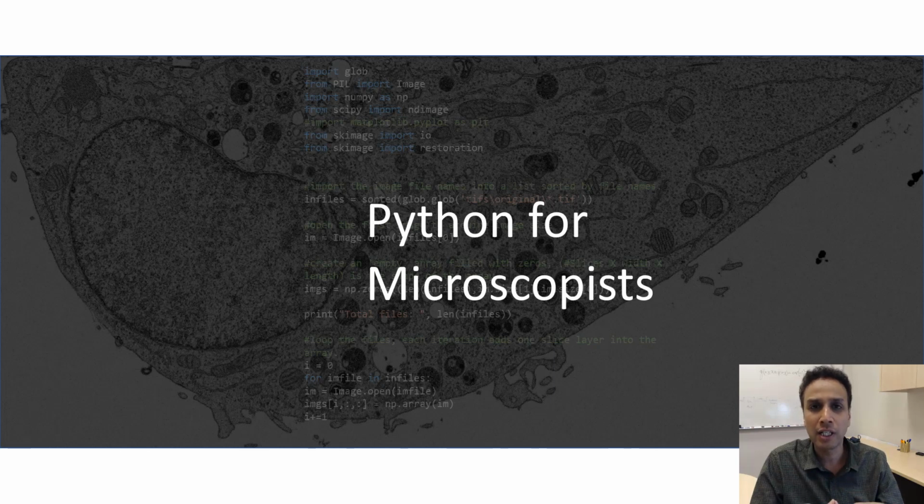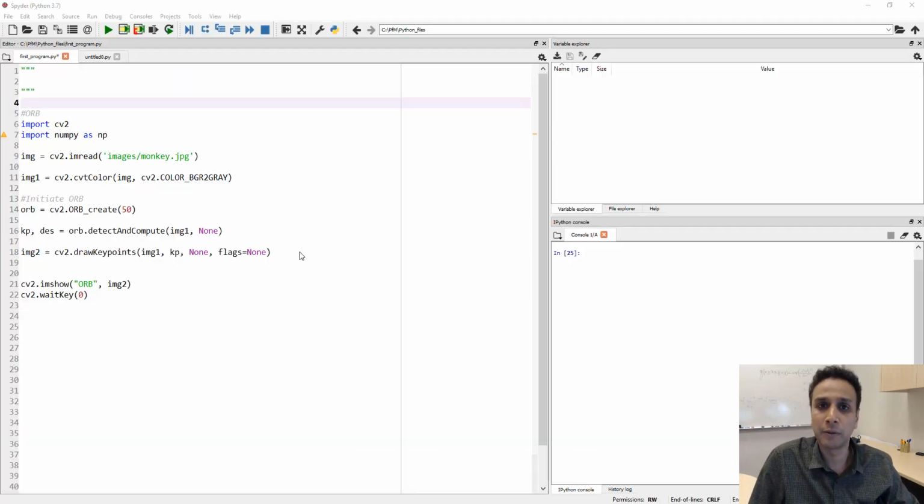And in today's tutorial, let's look at an application where we have two images, one reference and one warped or deformed. And let's take the deformed and transform it, stretch it to match or to register with the reference image. And this is probably needed for microscopy anyway, because most microscopes drift, especially the older ones, and especially if you are collecting images over a long period of time. So registration may be something that you can find useful. So let's jump in and start writing our code.